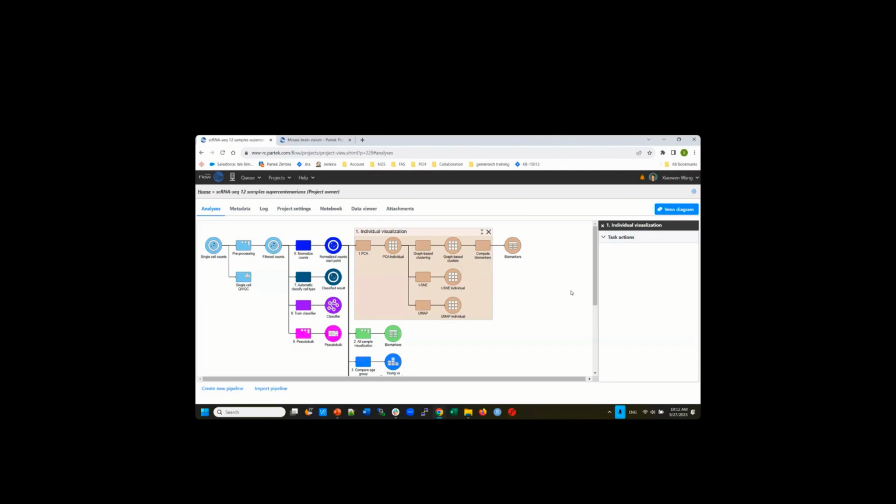Usually, if you only analyze your data and your data was processed in one lab, or in one batch, you really don't need to worry too much about batch effect. Only when you try to integrate your data with other people's data, or if you integrate data from different assays, like some samples processed using one prep kit and the other using a new version of the prep kit, then you might have a batch effect. In that case, yes, it's reasonable to remove batch effect.